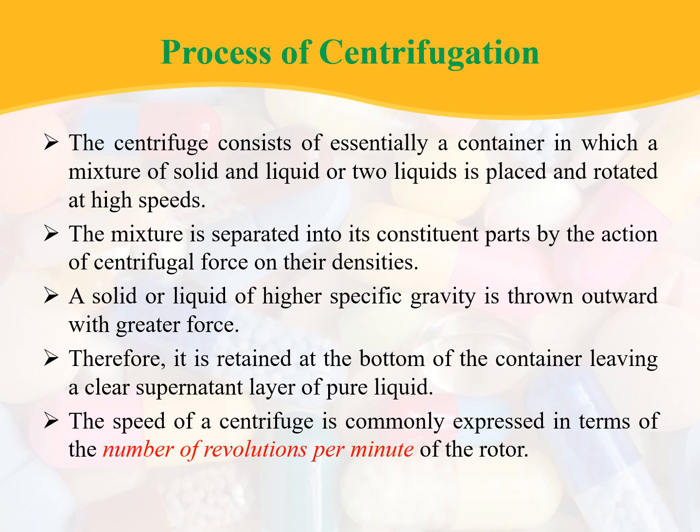Now, let us discuss the process of centrifugation. The centrifuge consists essentially of a container in which a mixture of solid and liquid, or two liquids, is placed and rotated at high speeds. The mixture is separated into its constituent parts by the action of centrifugal force on their densities. A solid or a liquid of higher specific gravity is thrown outwards with a greater force. Therefore, it is retained at the bottom of the container, leaving a clear supernatant layer of pure liquid.